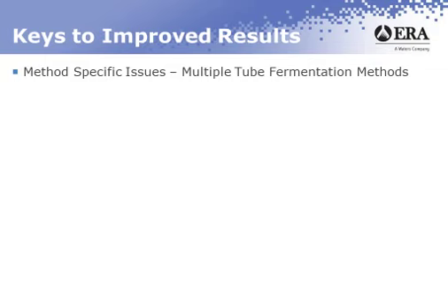Okay. Keys to improved results related to multiple tube methods. I wanted to get into a few issues here. Again, I also wanted to mention if you're doing a tube method that involves a pre-enrichment with some type of membrane filtration technique, refer to what I was talking about with the membrane filtration techniques related to that portion of it. This is primarily focused on doing tubes.